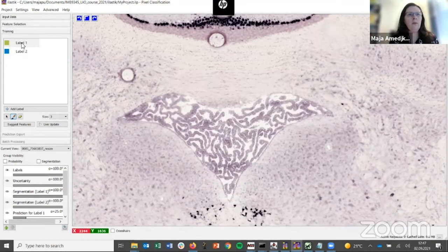So here, you label this one background and this one cell, and then you can switch. Here you will have a pencil, and what you're interested in is segmenting those black cells. So you can mark background here, and then cells, you can mark those here.